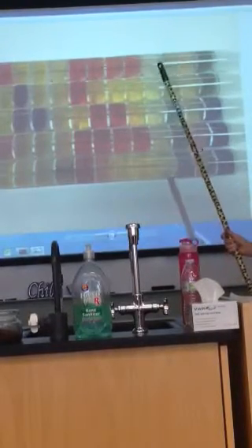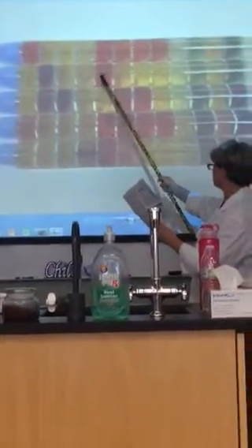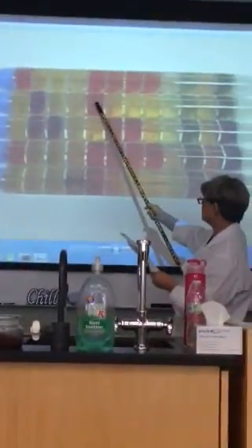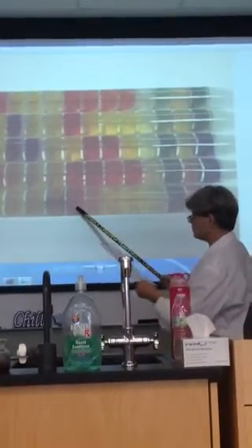Forget which one is which. I have to check. The first one is adonitol. Wait, that's H2S. This one, adonitol. Serratia, excuse me, E. coli does not ferment adonitol. Serratia does. Look, Citrobacter didn't.